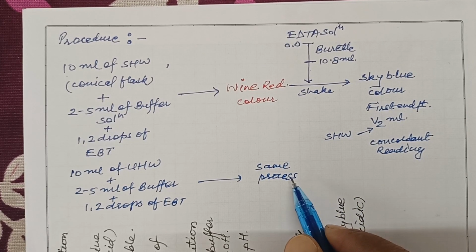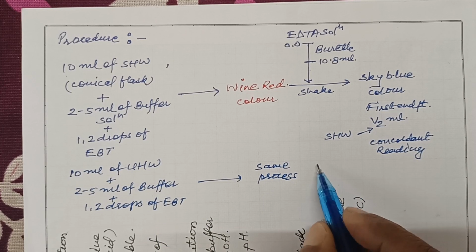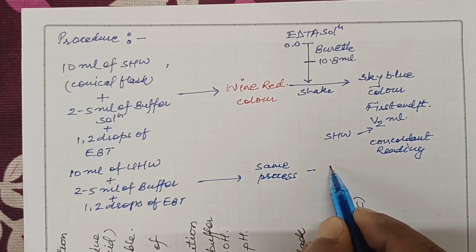So with the unknown hard water, we get the second endpoint.